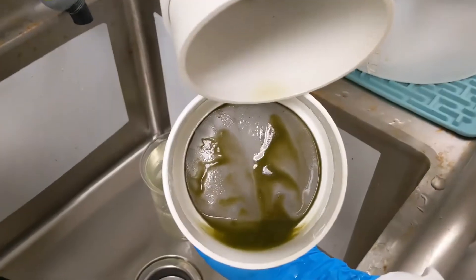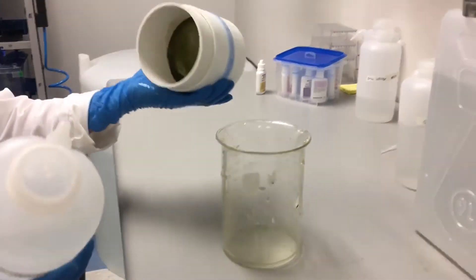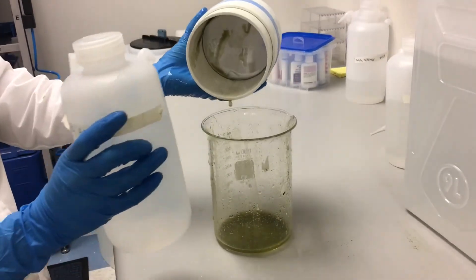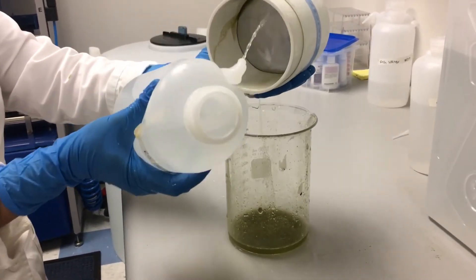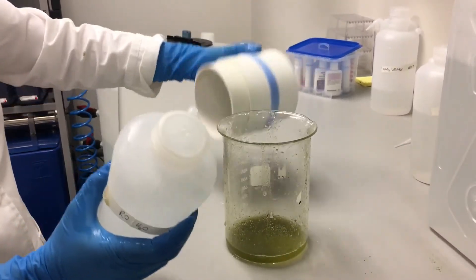Here is our rotifer harvest. We rinse the rotifers into a beaker using a spray bottle with five parts per thousand salt water. Rotifers can survive in salt water ranging from 5 to 40 parts per thousand, with 15 to 20 parts per thousand being the optimal salinity.